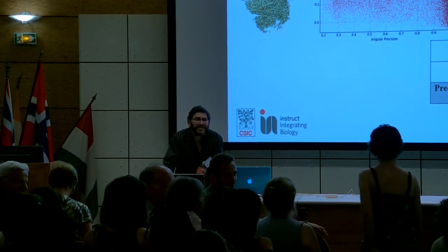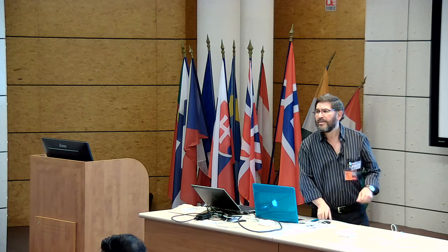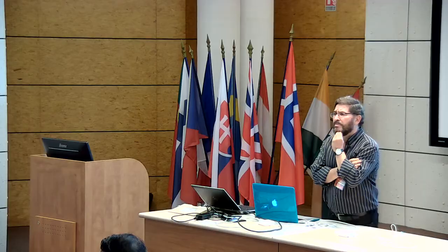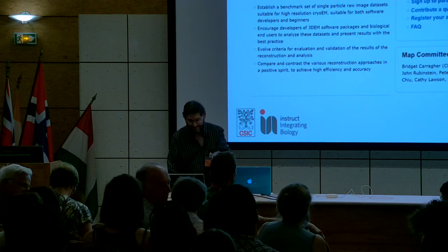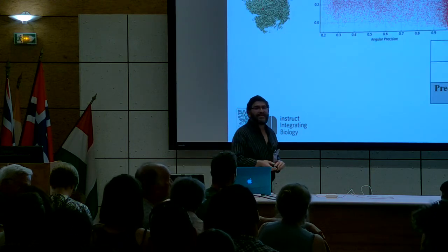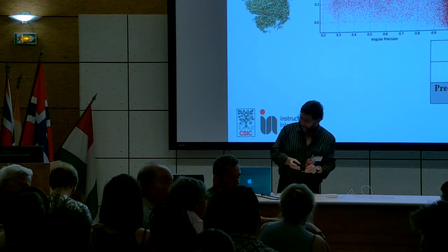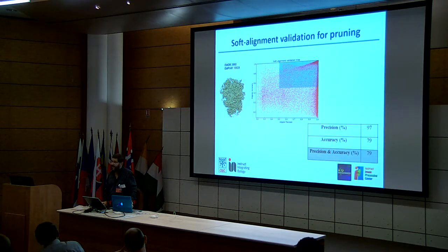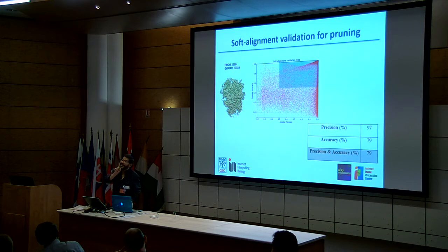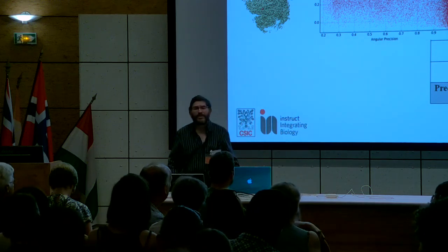I think I will express nearly the same question as Sriram and yours. Yes. The general problem with this given molecule was that it was not the right data. In general, if you have a local minimum, from my point of view, the local minimum possibly can reflect some kind of conformational form of the same complex. But in this case, it's a bit tricky and, from my point of view, a wrong example, because it has been shown that the images didn't contain the protein. Look at that from the facility or the database point of view.